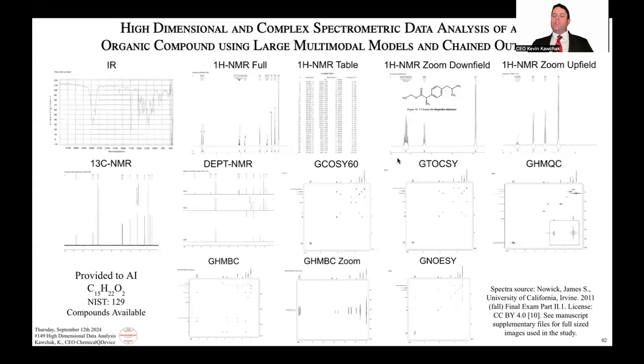And I would say out of all of these, ChatGPT 4o, I think several weeks ago I upgraded the model, and I tend to get even better results. Okay. And then they doubled their image uploads from 5 to 10. So it's going to be some time before there's broad utility of using 2D NMRs, especially because it takes more training data. There just hasn't been nearly as many experiments for 2D NMR as there is for one dimensional proton and carbon. And there's other atoms too to focus on. But that's the moral of the story here, there's a lot going on.